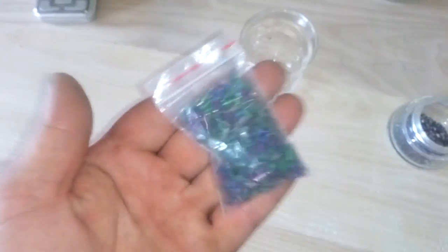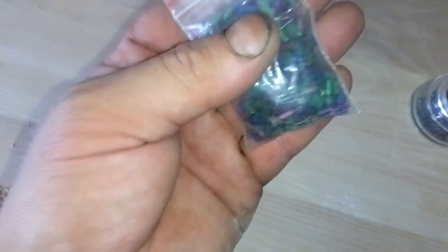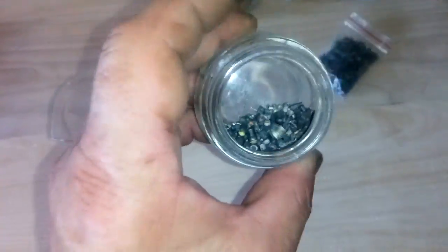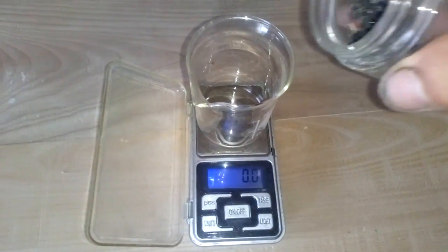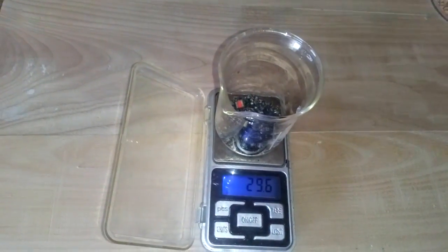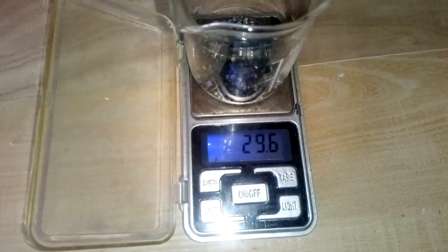This is our tantalum from our previous video — look how nice and clean. I think I got about half an ounce from these. So what we're going to do first is just put it on the scale and see how much we lose in the nitric acid batch. We got 29.6 grams.